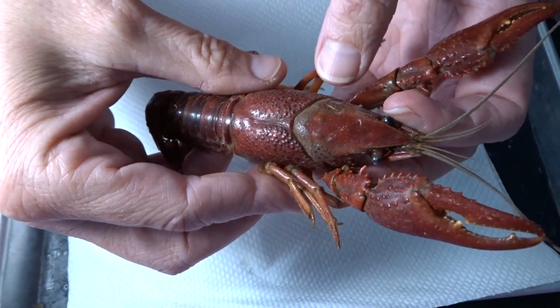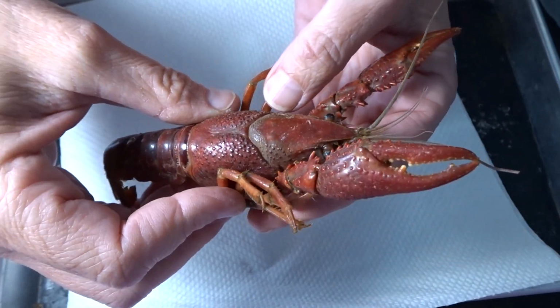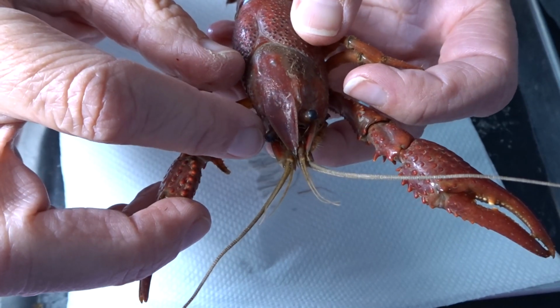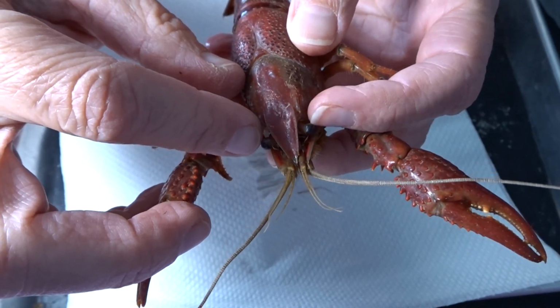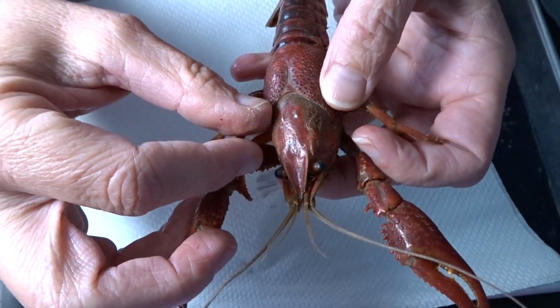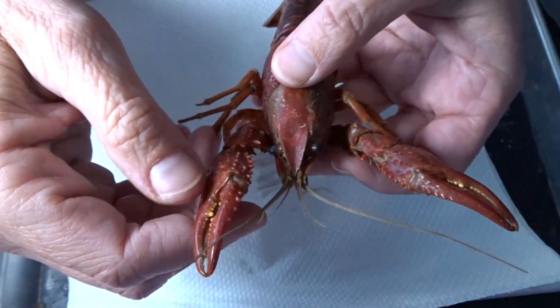So whenever we're looking at this, right? Ooh, look at their eye. Look at that. And that's something that also the eyes are on eye stalks and they're movable, right? And they can see at night. We'll talk about that more in the PowerPoint lecture, the functions of all these things. Oh, I just lost a leg.